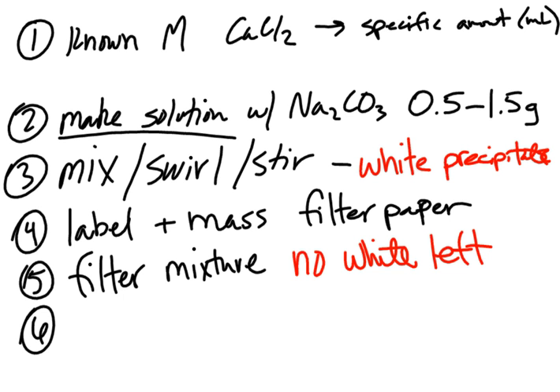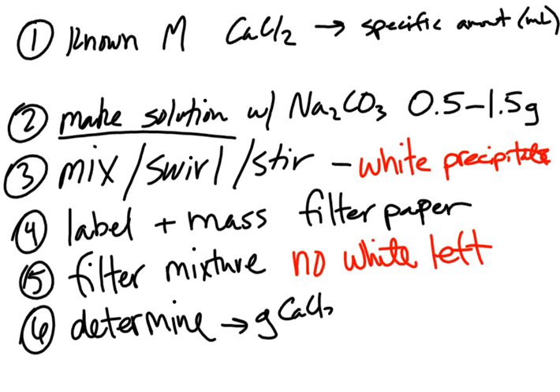Now, while you are waiting for it to filter, you should determine a couple things. One, you should determine the mass of calcium chloride that you had in that known molarity of solution, right?